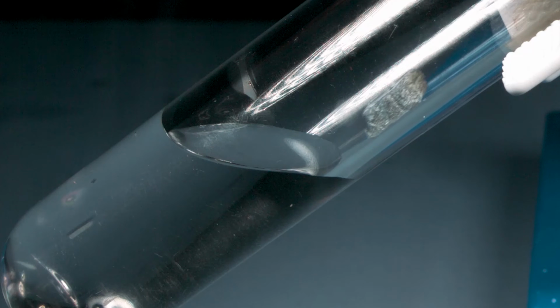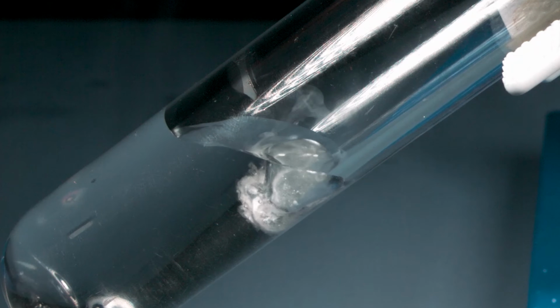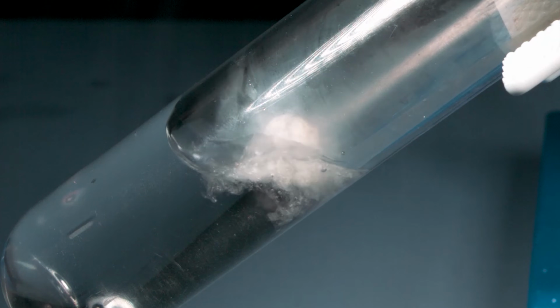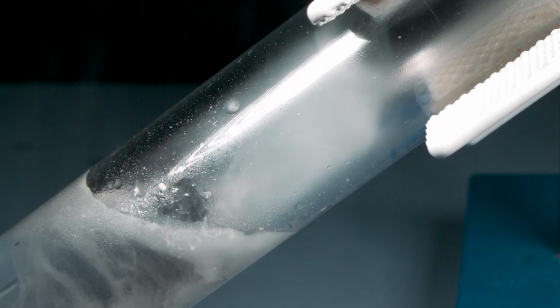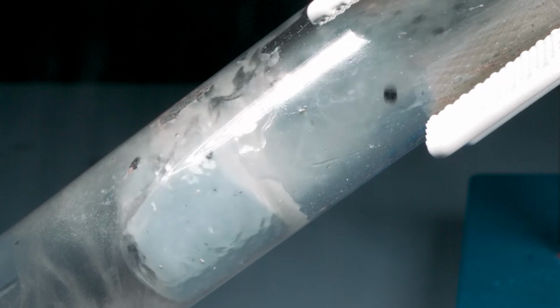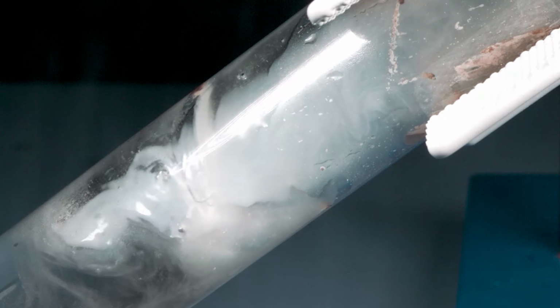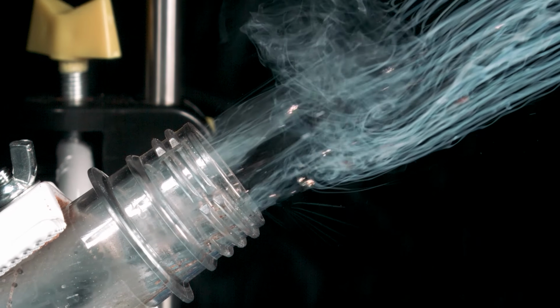Here's a close-up of the potassium entering the water. You can see that it begins to react almost immediately, violently producing hydrogen gas in the tube. Then when we get a little bit farther down the line, the explosion happens almost immediately, even at over 1400 frames per second. It spews the molten potassium up the test tube. It's very sudden and very, very violent. Here's a close-up of the end. You can see all of the shrapnel coming out.